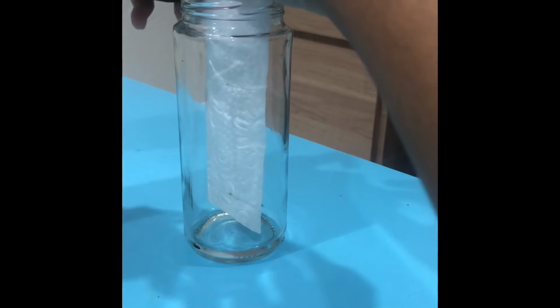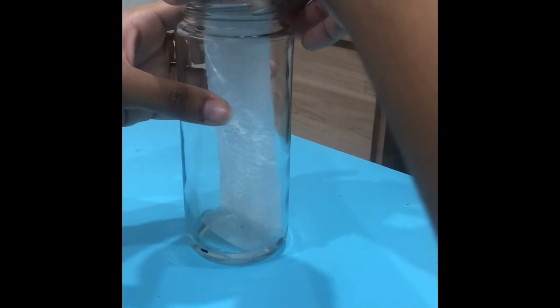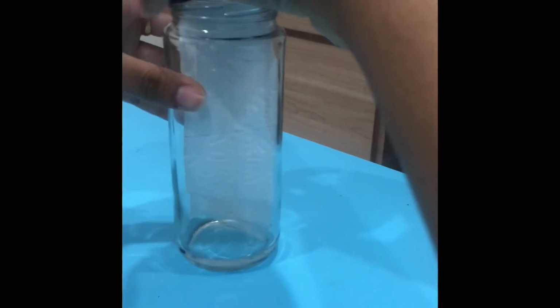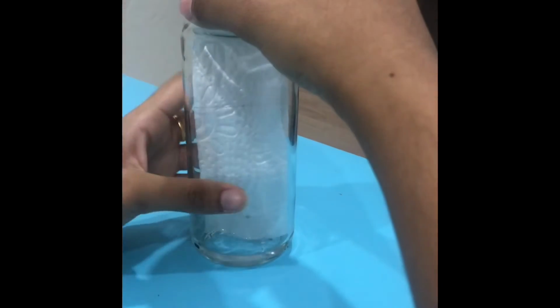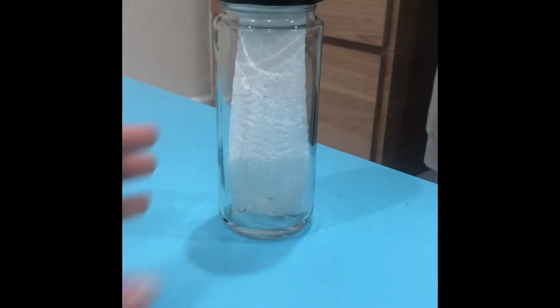Okay, and then I have to close it straight away. Make sure it doesn't fall down too much. Okay, so we'll just have to wait for it to reach the line and we can see how far it traveled.